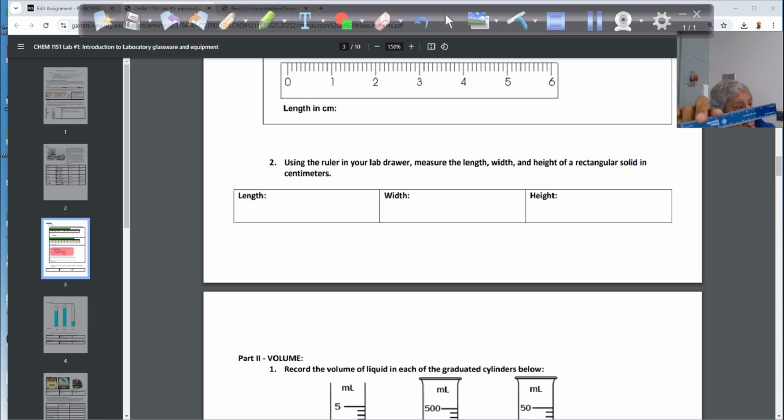And the centimeters themselves are divided in 10 pieces. Each one is a millimeter. A centimeter is 10 millimeters, correct? 10 of those subdivisions are 1 centimeter. Each subdivision, the small tiny one, is 1 millimeter. So 10 of those are 1 centimeter.